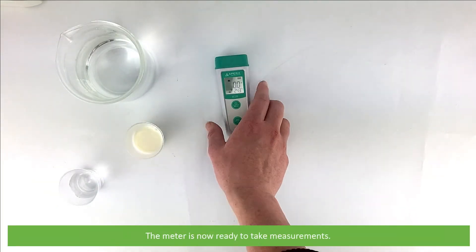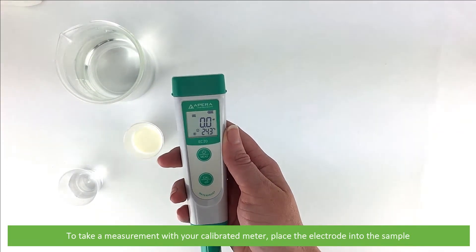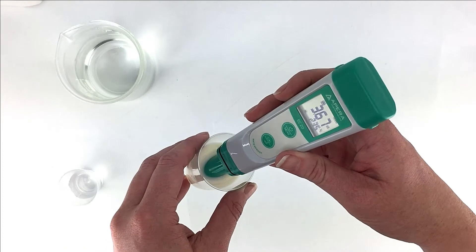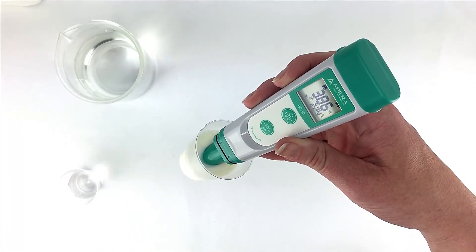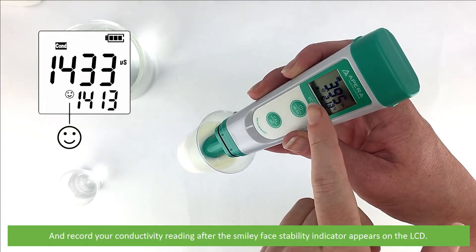The meter is now ready to take measurements. To take a measurement with your calibrated meter, place the electrode into the sample. Record your conductivity reading after the smiley face stability indicator appears on the LCD.